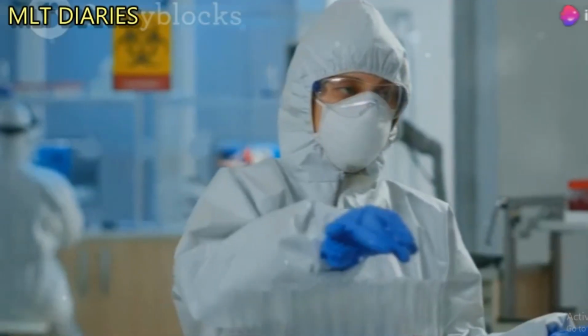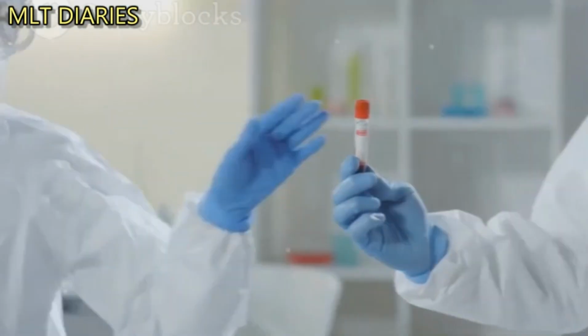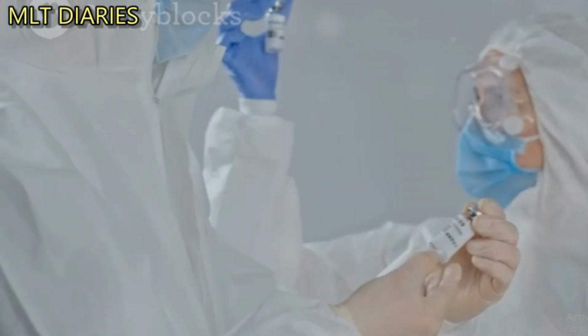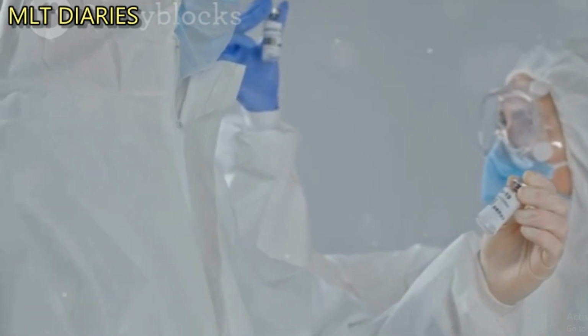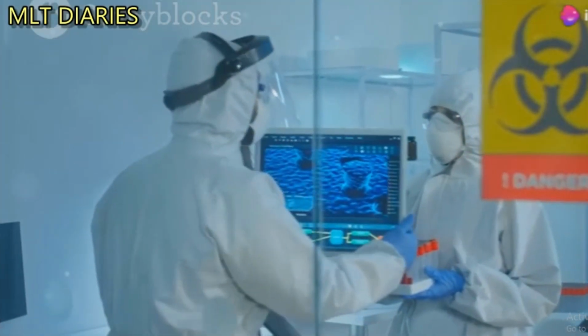Now let's talk about performing a risk assessment. Identify the biological agents you'll be working with. Evaluate the risks associated with these agents. And determine the appropriate biosafety level, BSL, for your work.